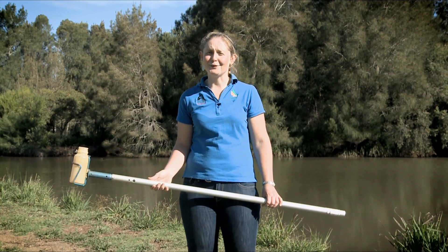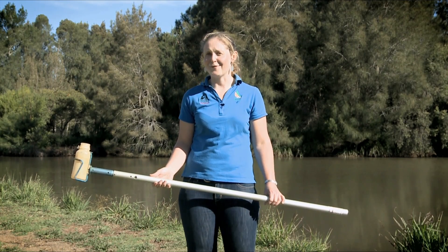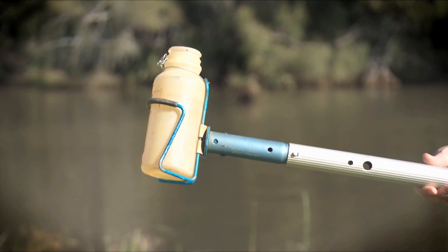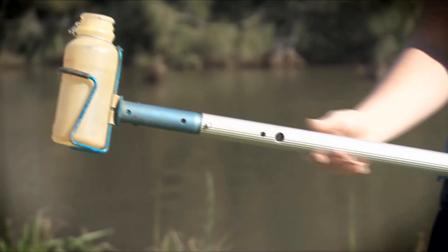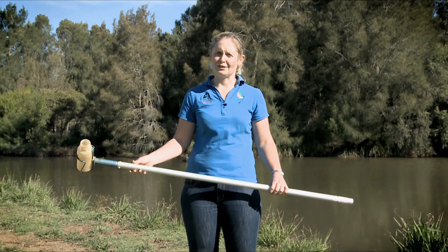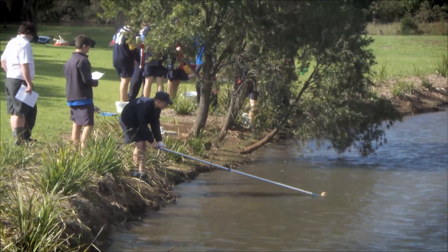To take a water quality sample to look at the physiochemical parameters of the water, we usually use something along these lines. In effect, it's just a pole with a wide-mouthed bottle on the end, and we use this to reach into the centre of the stream to collect our water sample.